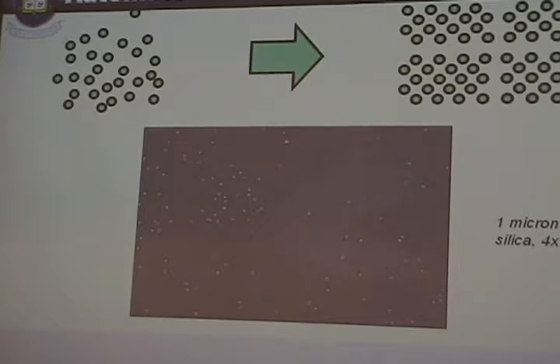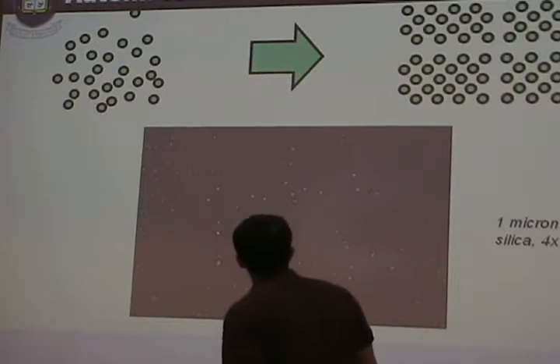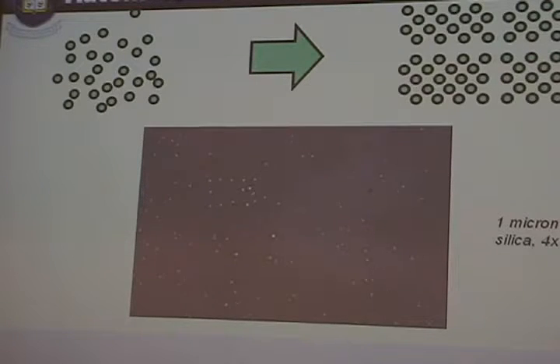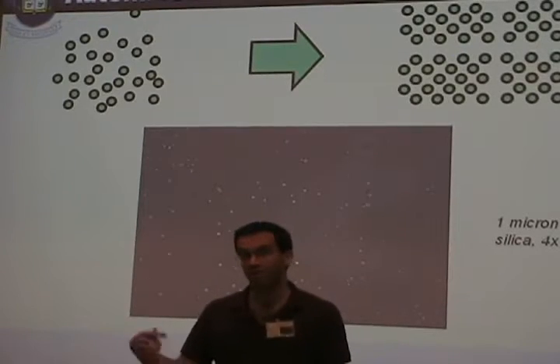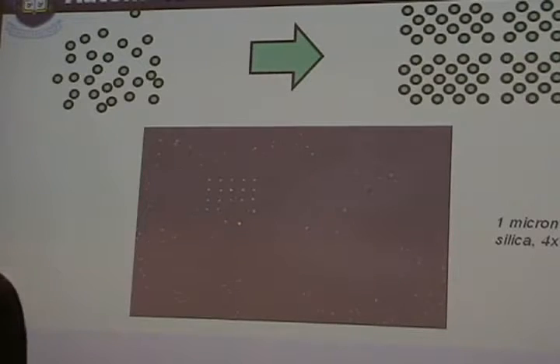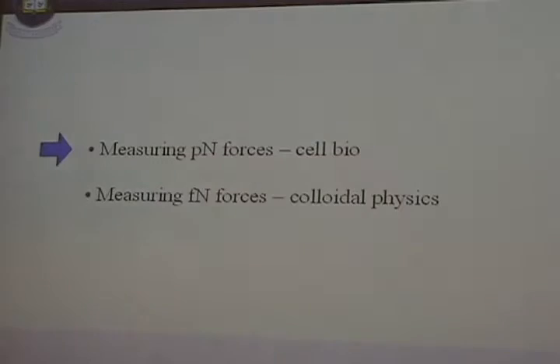And it does. Now this is a pretty old movie. It's a few years old now. Things happen faster now, and also we have better error correction, so we can build things without defects. But the basic idea is that we can build complex adaptive matter, not from self-assembly, but from the top down at the microscale, and really intervene in complicated ways. And that is useful for doing all sorts of physics and biology experiments, as I'm going to explain in the rest of the talk. Right, so that was sort of the basic technology section.